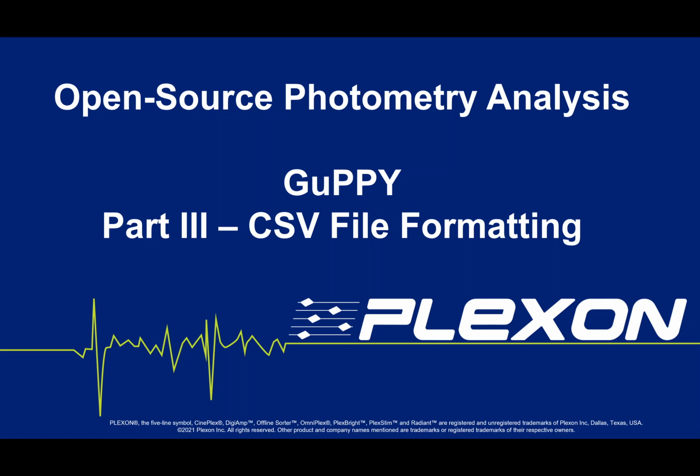Welcome to part 3 of the video where we are going over using the open source photometry analysis program GuPPY for analyzing data collected on a Plexon multi-wavelength fiber photometry system. First, we're going to go over how to correctly format the CSV files for use in GuPPY.